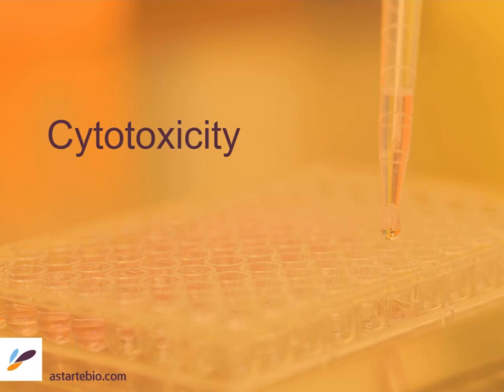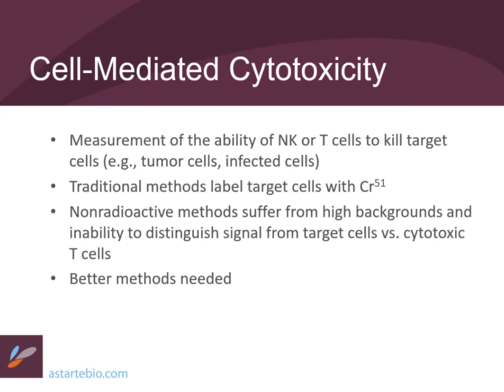The last method I want to touch on is cytotoxicity. As I mentioned, this is a nice readout to have in your back pocket. It's how we measure the ability of natural killer cells or T cells to kill a target cell, whether that's tumor cells or cells that might be infected with a virus or bacterium.